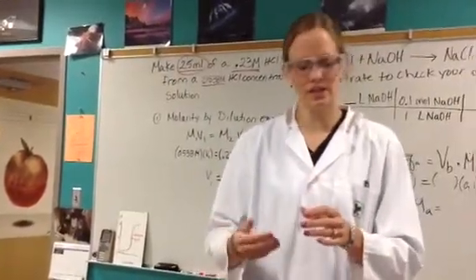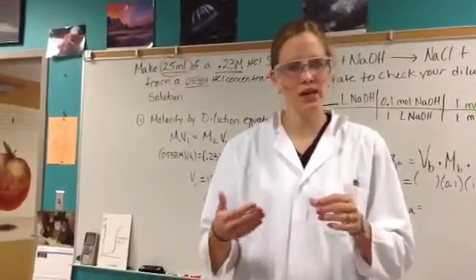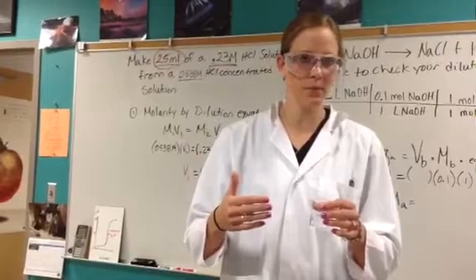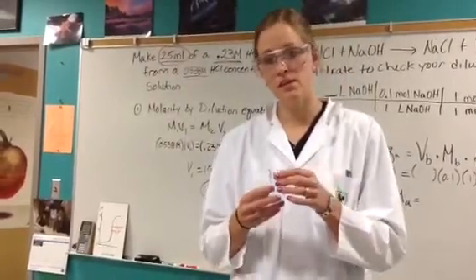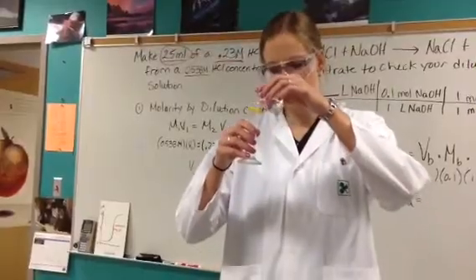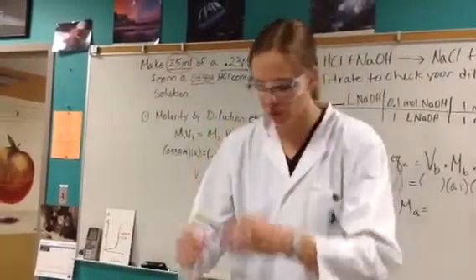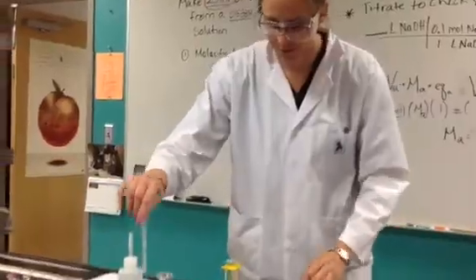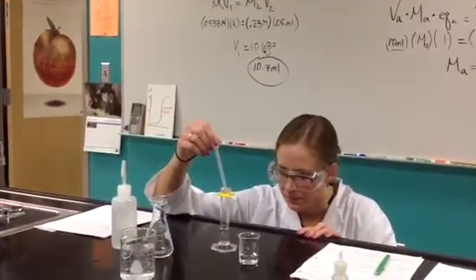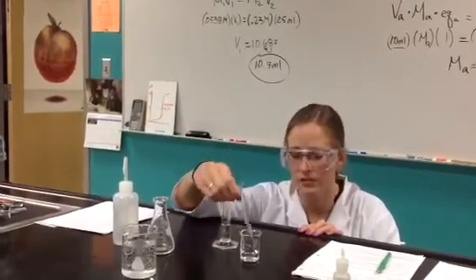We want to titrate the solution — I've made my dilution, but I have no idea what the actual concentration is. To figure that out, I'm going to do a titration just like you did with the monoprotic and diprotic labs. I'm going to use 10 mils of this solution — pour most of it into the graduated cylinder and use my pipette to get right to 10 mils. Get eye level with the graduated cylinder, using all the techniques you learned in our first lab.